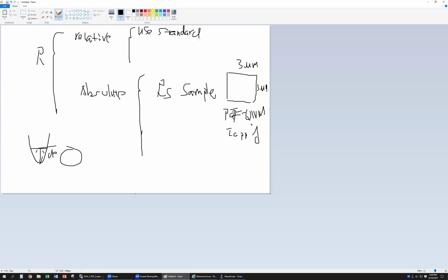So for example, if you want to measure something very soft, you may use the simple one, number one, number two. Then if your sample is hard, you may choose the 3. If it is very hard, you may choose the HOPG. So that depends on which one you should choose. Okay. So put the standard sample on, because this modulus is known.